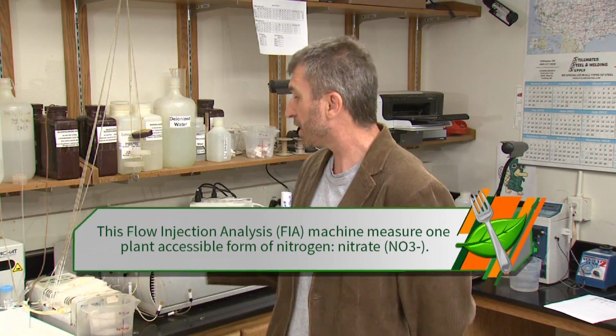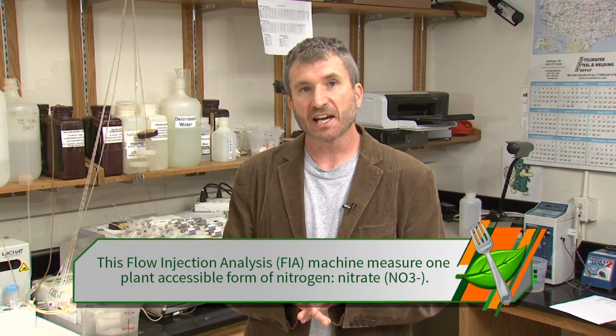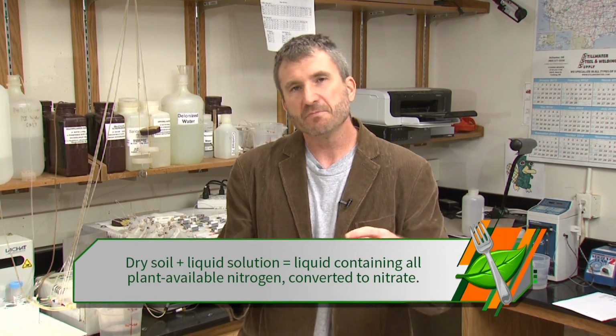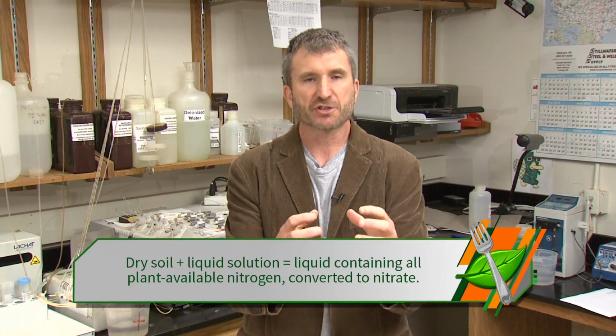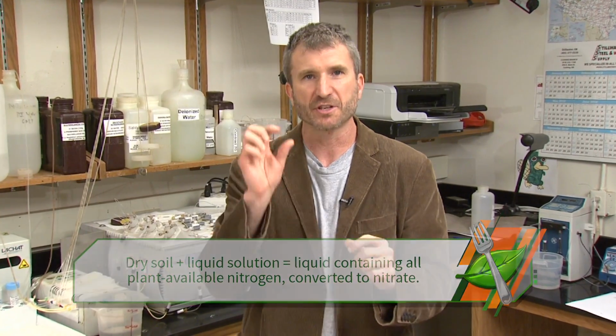For most farmers, the most important piece of information from the soil test is the nitrogen content of the soil. And that's measured using a flow injection analyzer like the one you see here. It works basically like this. You have that dry matter of the soil sample, and then you mix it with a liquid solution. That liquid solution is designed to extract all of the nitrate. Nitrate is a compound of 1 part nitrogen, 3 parts oxygen. And when plants are consuming nitrogen, most of it is nitrate that they're consuming.